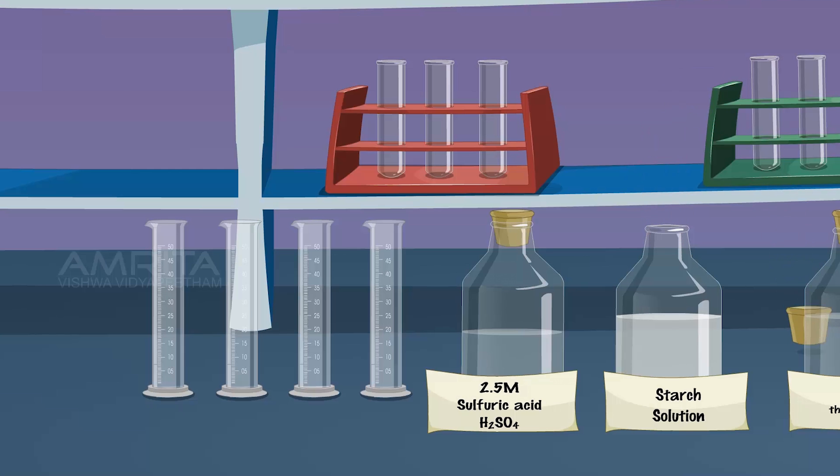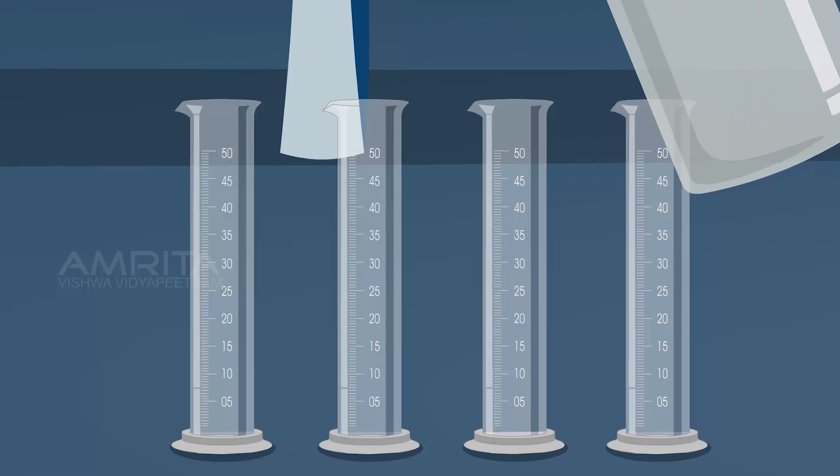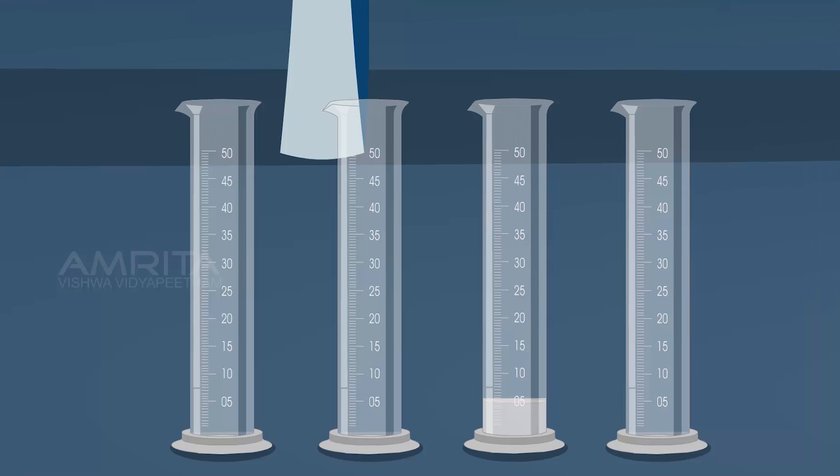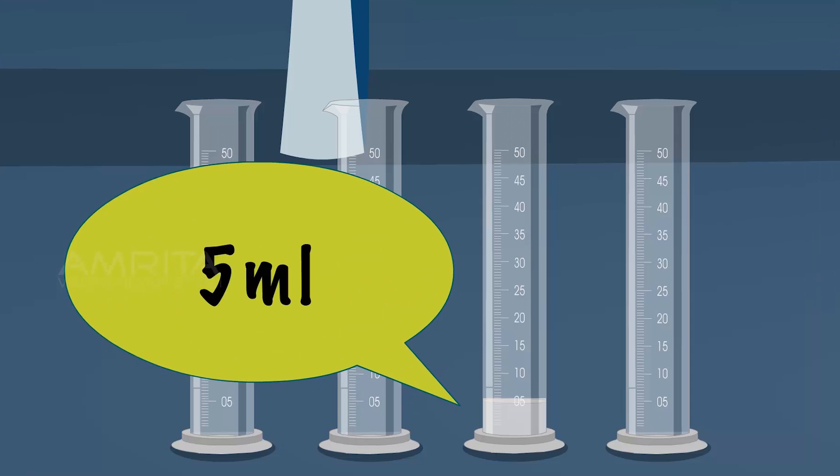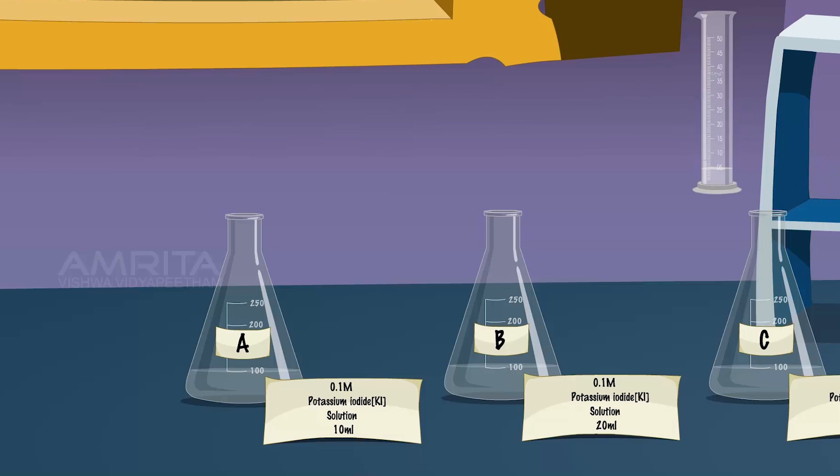Measure 5 ml of starch solution in a measuring jar. Pour it into flask A.